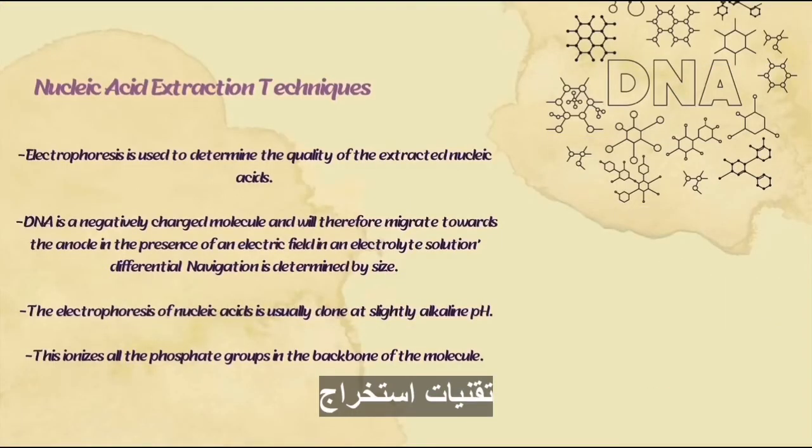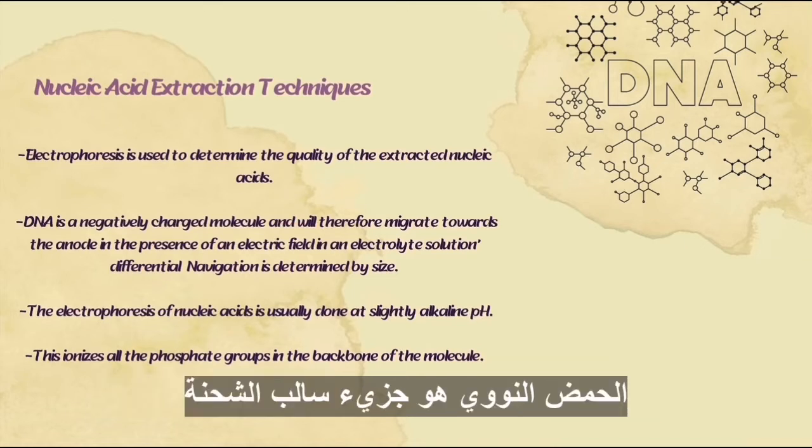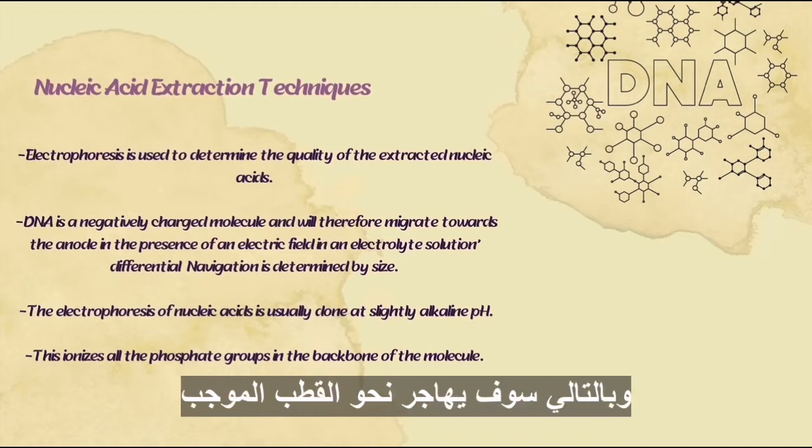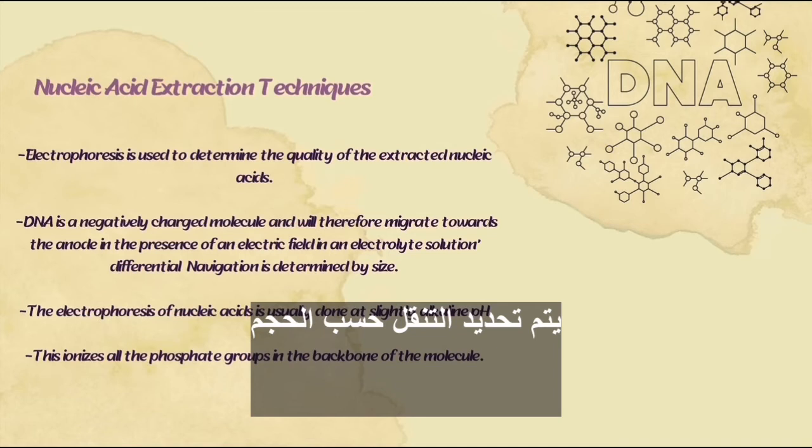Nucleic acid extraction techniques. Electrophoresis is used to determine the quality of the extracted nucleic acids. DNA is a negatively charged molecule and will therefore migrate towards the anode in the presence of an electric field in an electrolyte solution. Differential migration is determined by size.